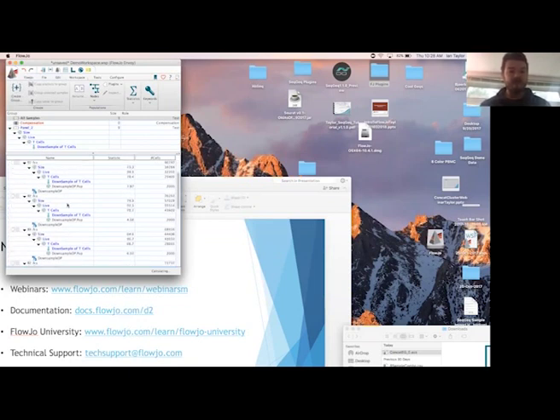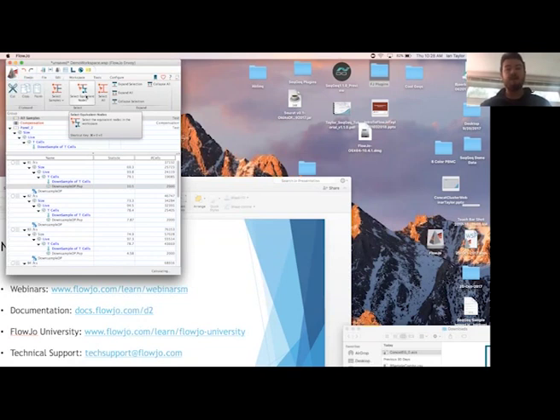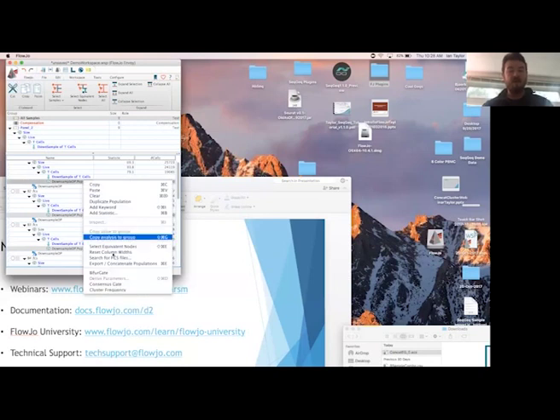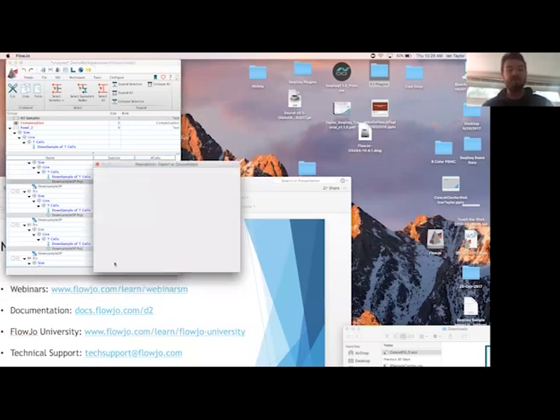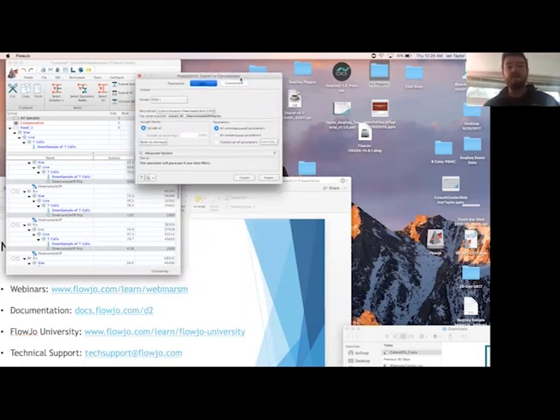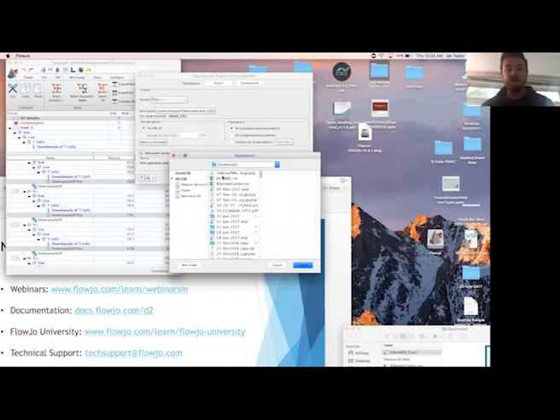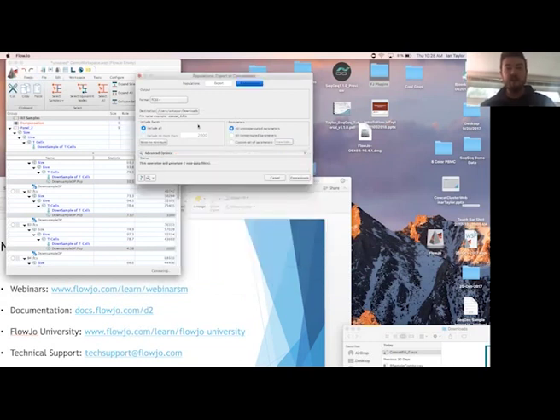Once that's completed, I'm going to select that downsampled population and combine them all. So again, the shortcut here is select equivalent nodes. That should select all of our downsampled populations. Now if I right click, I can simply choose export concatenate, and that will bring up this concatenation window that we've seen before. I'm going to choose concatenate, and I actually want this to go to my downloads folder, so I'll change that. We notice here that there's an acquisition defined matrix for all of these samples, which I happen to know is in common for all of the samples. So I'll just use the uncompensated parameters again.